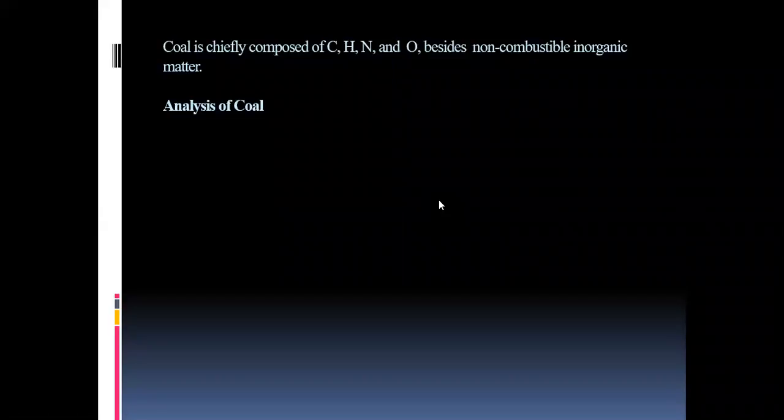Today we are going to discuss the analysis of coal. Already you know that coal is an example of solid fuels. Similarly, petroleum is an example of liquid fuels and so on. Today we are going to discuss how coal is analyzed.